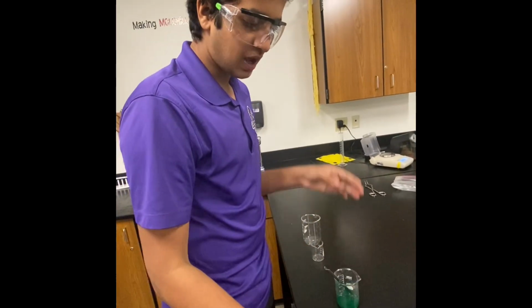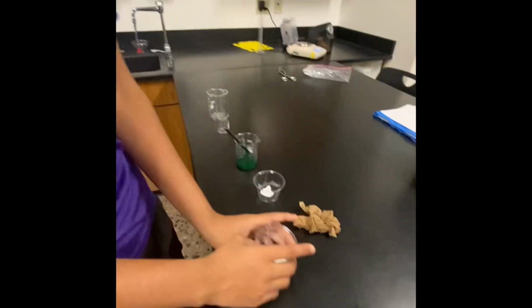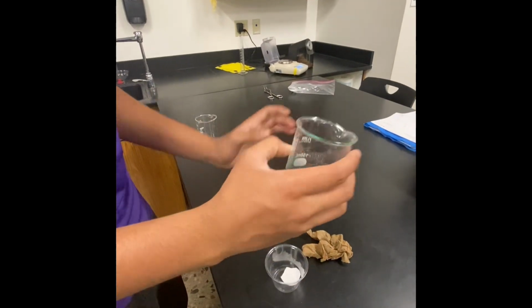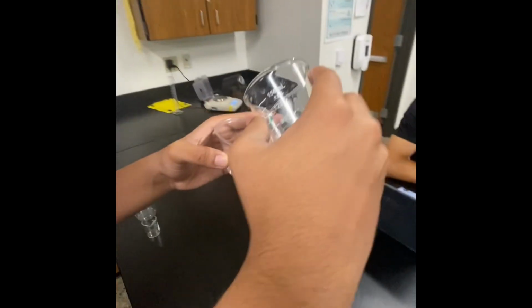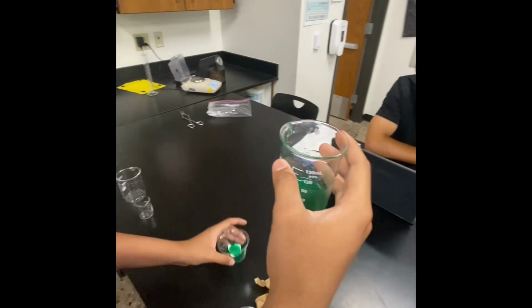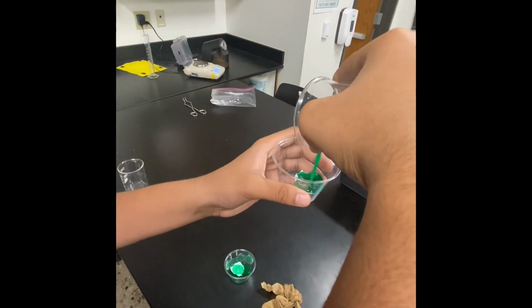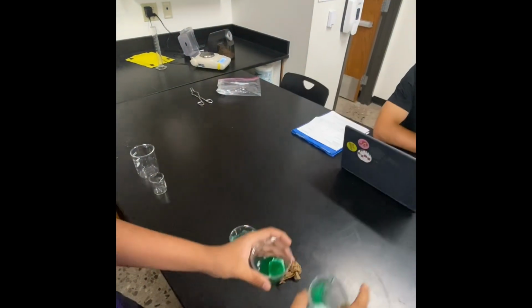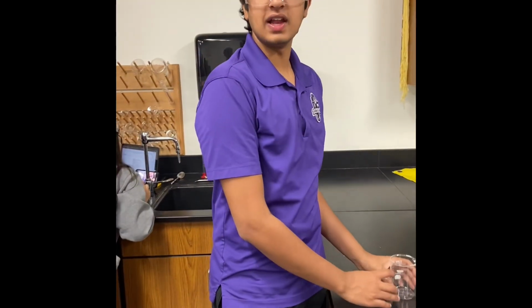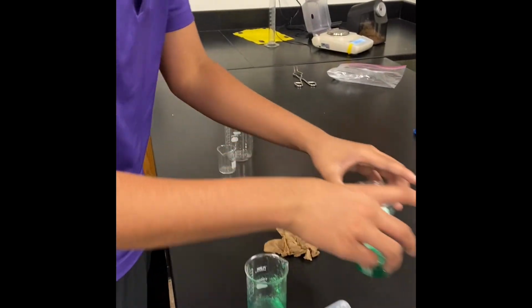I'll put each egg crystal formation in each cup, so we have 2. You don't really need to measure this next part out. Just use the eye test and make sure it's covered. Put it on the egg, right here. That's good, covered enough. And this one right over here. Perfect. After this, we let it sit around a day to come back for the results. We'll do that as we set these to the side.